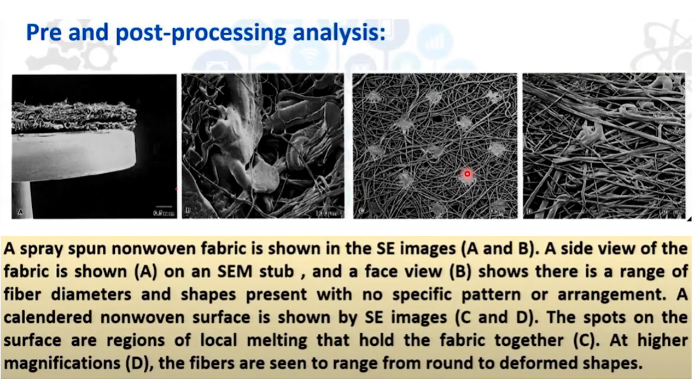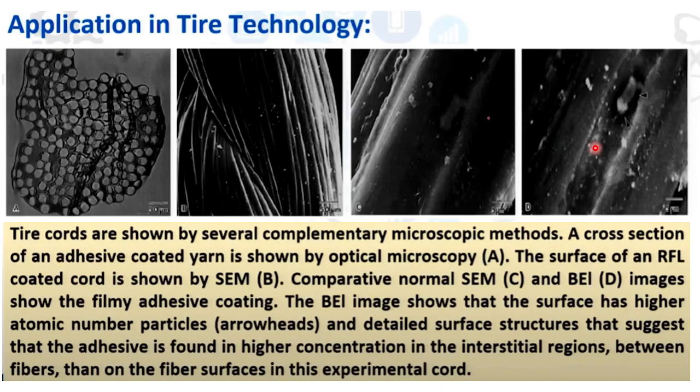So because of the crystalline nature, whenever it is undergoing different high temperature processing, the melting of the crystallites can take place. And whenever it is melted, that melted crystalline part is observed here. And if you further magnify it, you can check how it can bond with other fabric because of these crystalline patches that can be visualized.